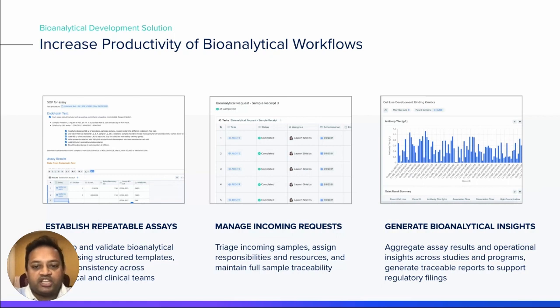In supporting GxP studies, bioanalytical teams require more capabilities for increased regulatory compliance, including for developing methods per guidelines, executing assays in controlled experimental setups, and enforcing quality compliance. Bioanalytical teams that work alongside preclinical teams, such as in vivo pharmacology, safety, and tolerability, must collaborate on sample intake, processing, and reporting back results that require full traceability. Being able to easily receive and assign tasks makes this back and forth work efficient.